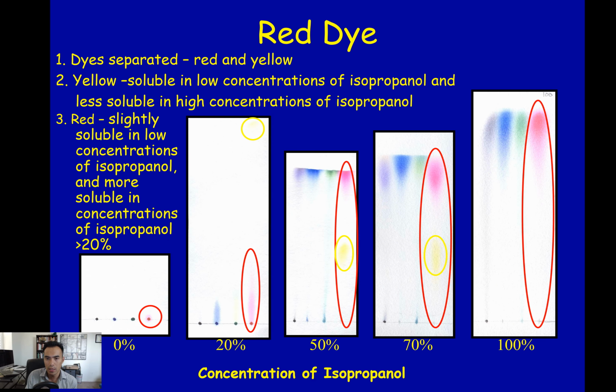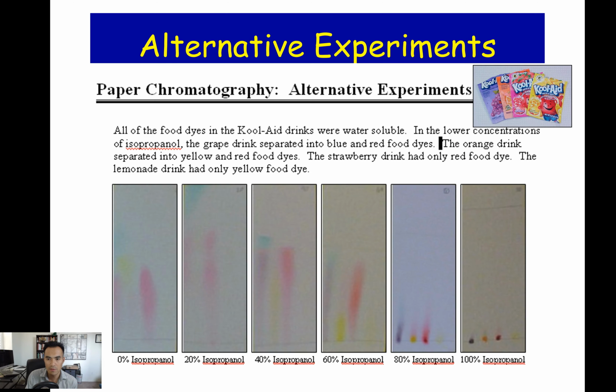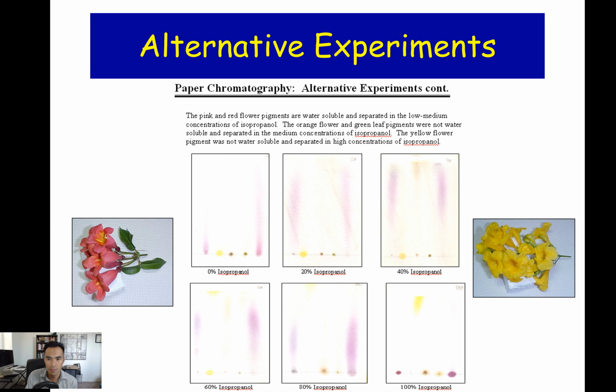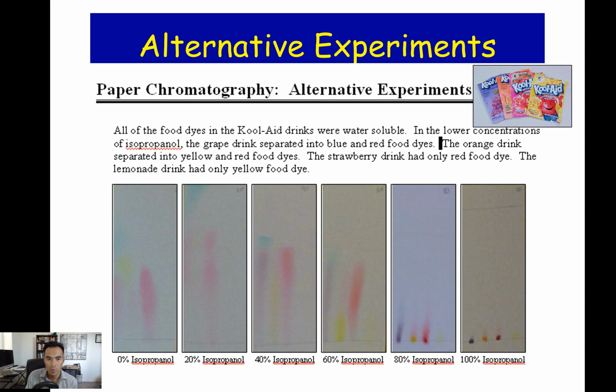Now, moving along, you can tell that with different concentrations, you can indicate specifically what happens with solubility. And so what I do want to do is challenge you with how well we can actually run this. Now, the first thing is paper is made from cellulose. It's actually a carbohydrate. It's technically what plants make for food and whatnot. And if you think about it, polarity on those molecules is generally speaking a nonpolar molecule. That's the reason why paper doesn't really dissolve in water. However, it does have nonpolar and polar regions.